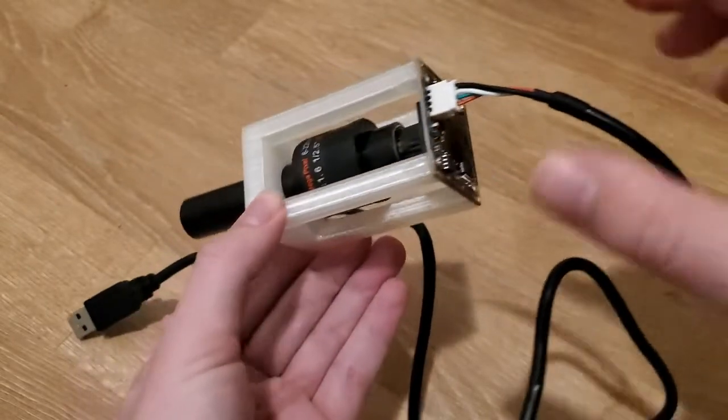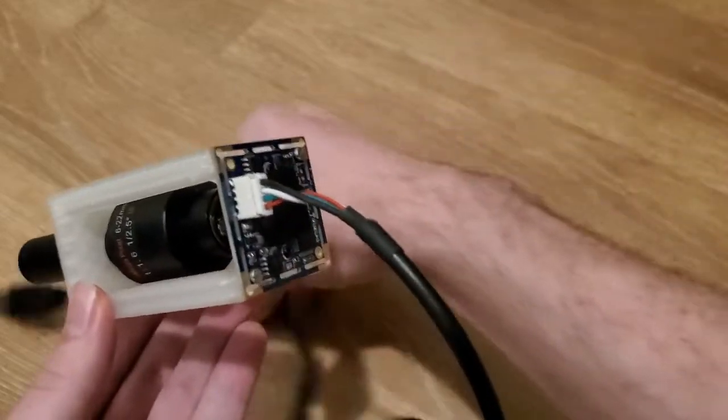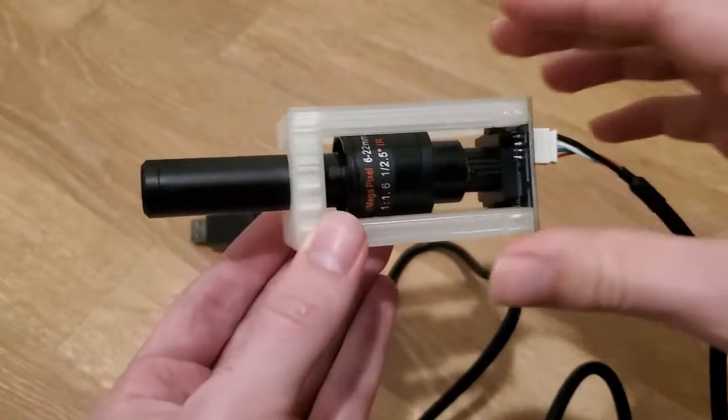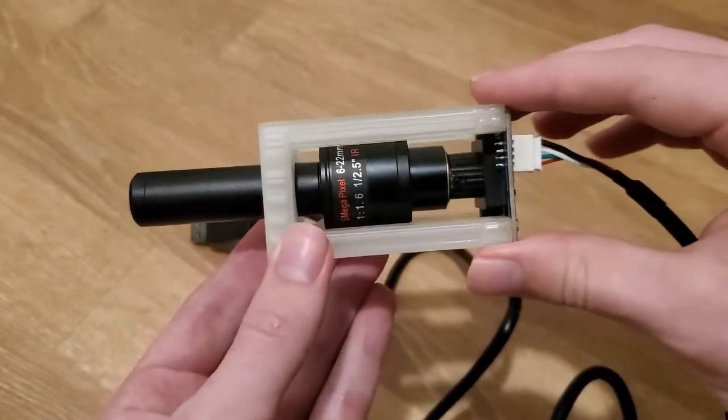I chose the USB camera in this case instead of a Raspberry Pi camera, because there's no setup or programming required. The 8 megapixel camera is probably overkill, and you could use a lower resolution option to reduce the price, but I wanted to optimize for image quality.